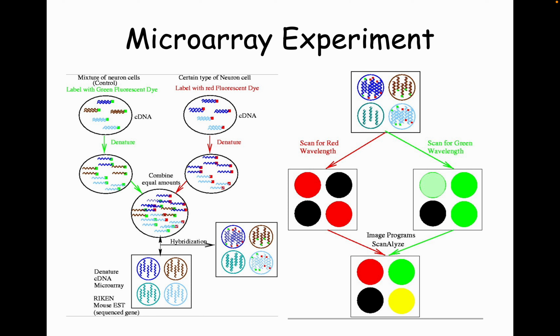And then if they have that protein with a serine or threonine, they will add a phosphate on. And so it's that kind of kinase. And so you can have an array with thousands and thousands of different things that can be phosphorylated. And you put some phosphate in the buffer, and you put your cell extract or your enzyme that you want to see, what does this do? And if it's a kinase, you will find out exactly what it's able to add phosphates to.